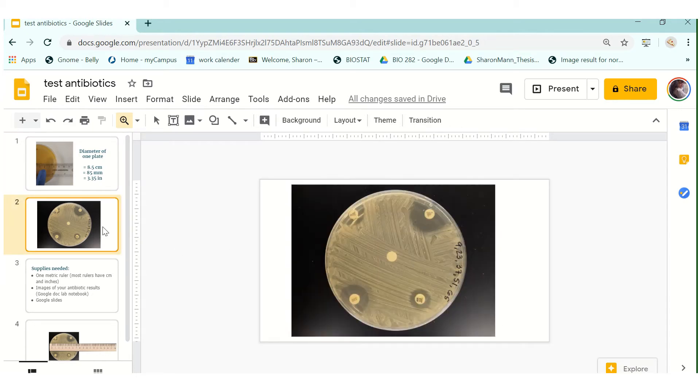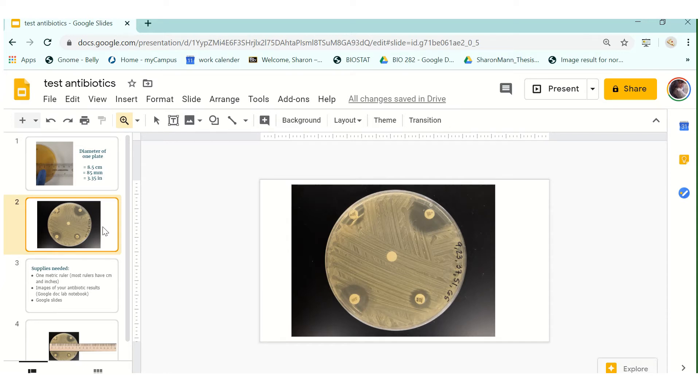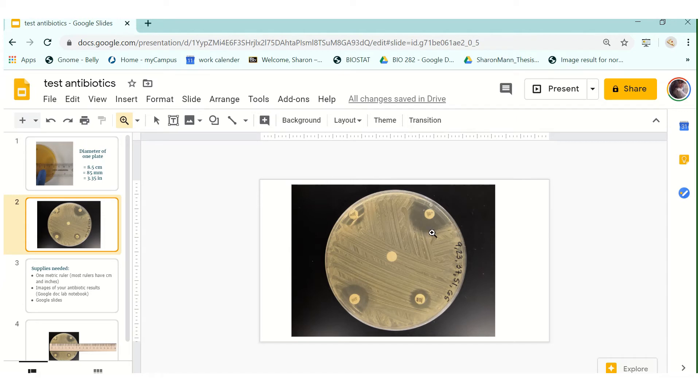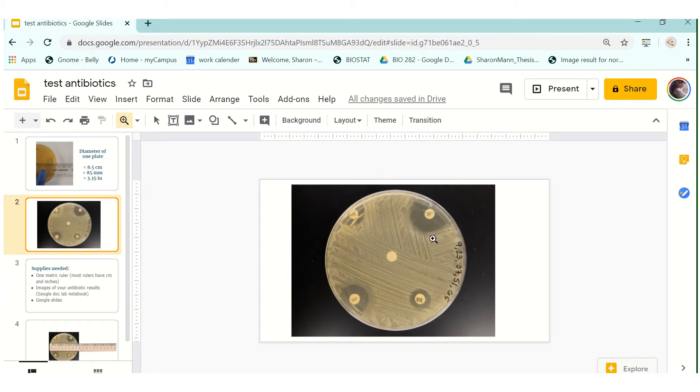So the reason why we need to know that is because we need to measure our zone of inhibition for each one of our plates. Each group will have four plates each with five different discs on it and you will measure each one of those zones of inhibitions. So a zone of inhibition is what is shown right here. This halo means that this is a clearing of bacterial growth so it has inhibited the growth of the bacteria.